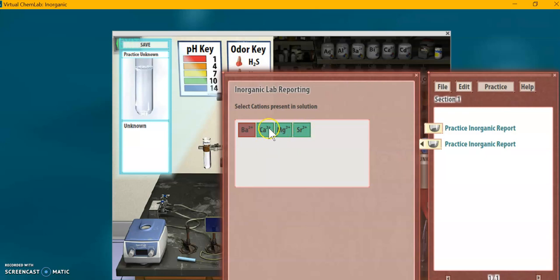As it turned out in this practice unknown, these were present, these three ions. That one I was wrong about. Hopefully, if I'd actually done all the chemical tests with this practice unknown, I would have done better than that.